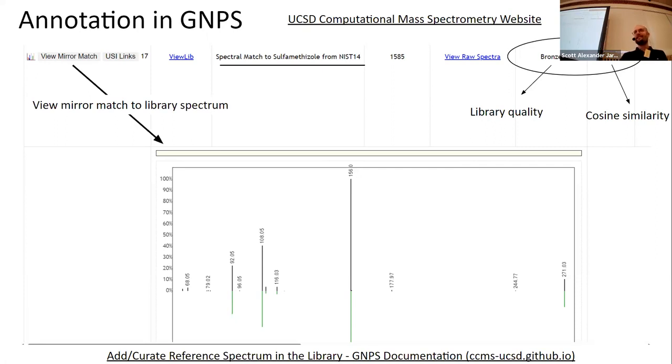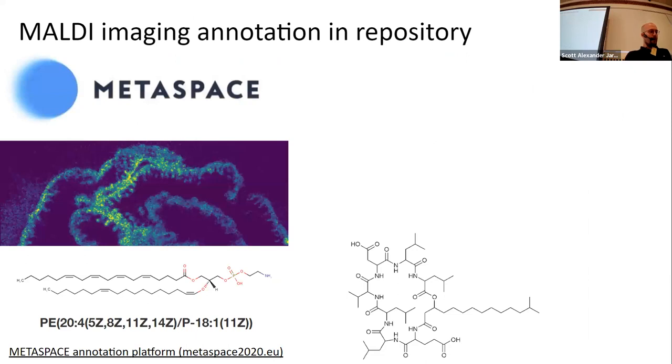There's also a quality that is a challenged spectrum, meant to say anyone in the community can annotate. You think it might be related to something, but you're not entirely sure. I honestly have not seen very many challenge spectra in the database, though. I don't know how many there are, but there is that level as well. And then to wrap up, just two more slides.